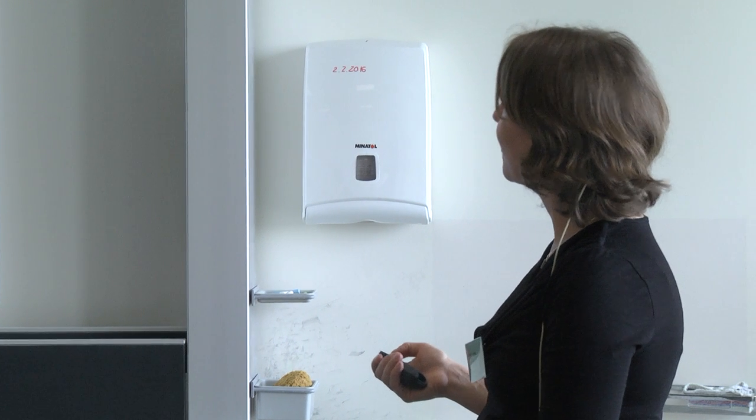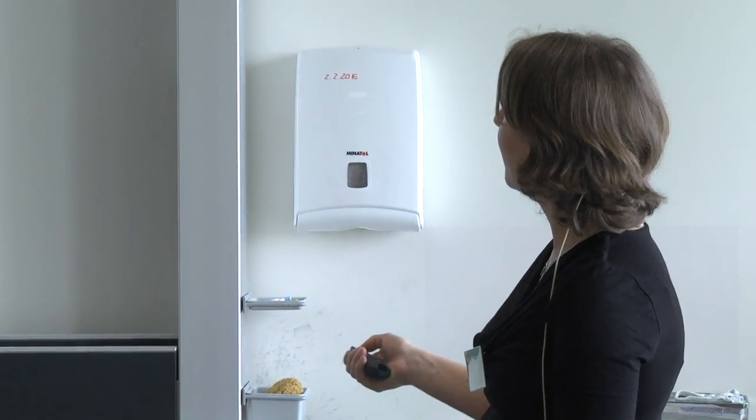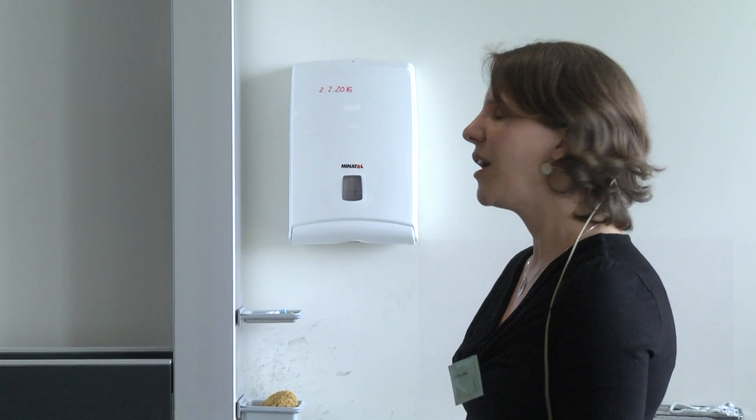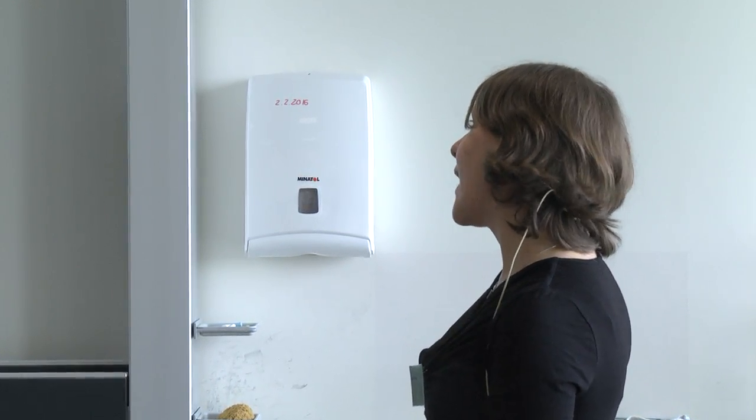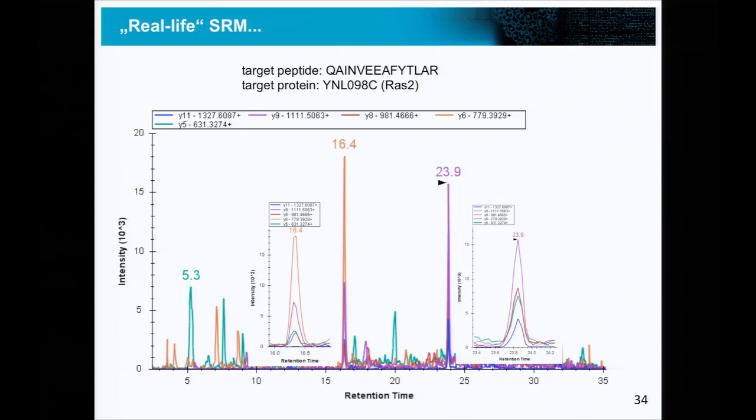The number of transitions. I mean, in both cases of the 5 were measured, but you're right. So here the blue transition is not present. So actually that's one guess that would rather hint to this, where you have all 5 and here you have just 4. But it can happen also in reality that the right peptide has one transition which is just very low because it was already in the MS2 spectra, one of the low ones. So I wouldn't say that this completely rules it out, but it's true. It's nicer. It points more towards this one.